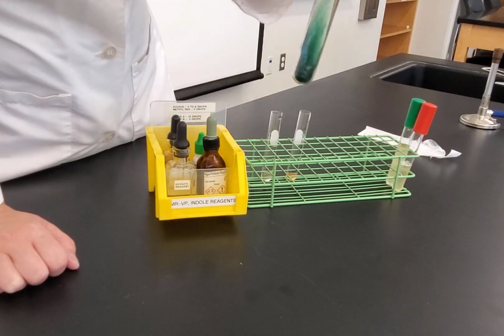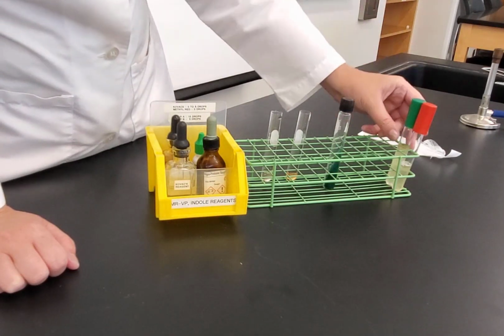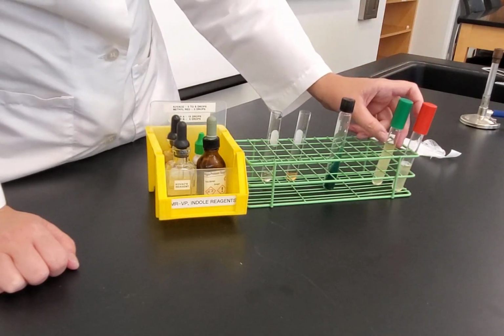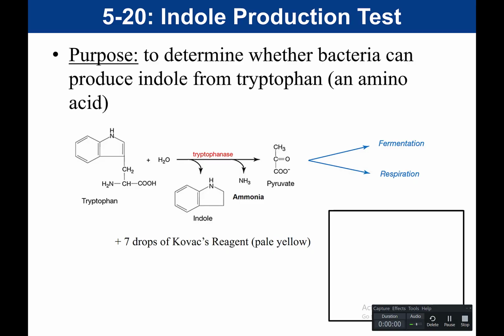The citrate, the readout is looking at the slant. I'll talk about this when I analyze the data. And the tryptophan could be analyzed right away as well. And so this is how we do our readout for our IMViC. So now let's talk about the readout for our IMViC.